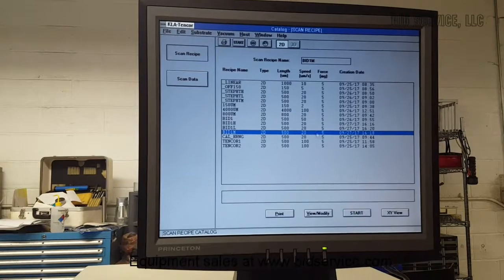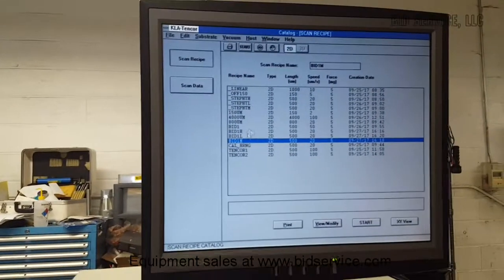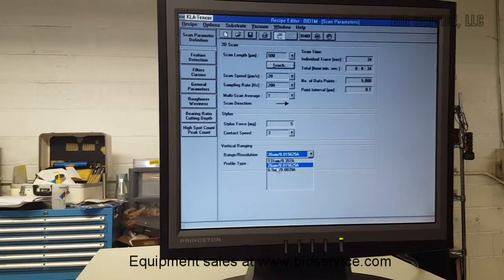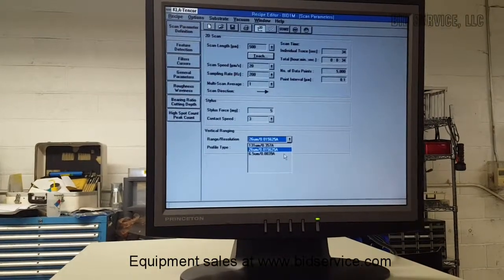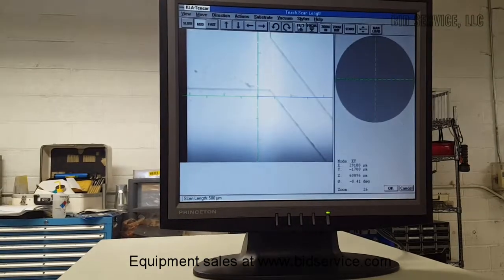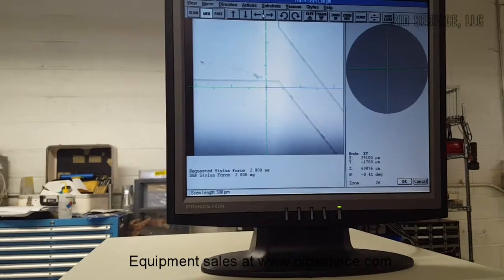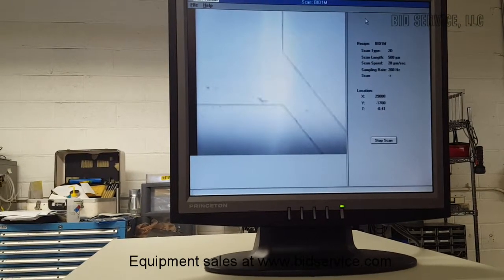And I'm going to select the medium range scanning program I have here, and these are the parameters again. So the vertical ranging, I've selected 26 micrometers. The last scan was 6.5 micrometers. So once we selected the medium range, I have a step here. I can scan and display, see the results.